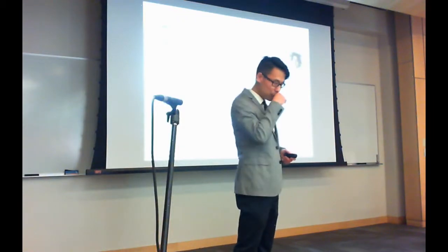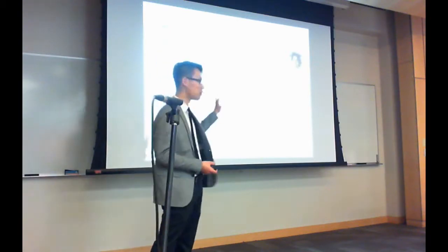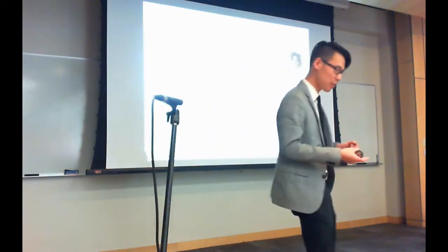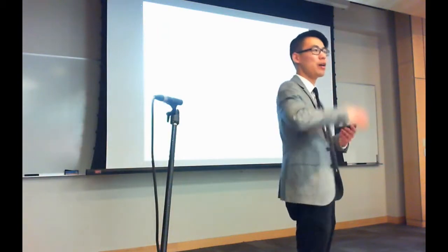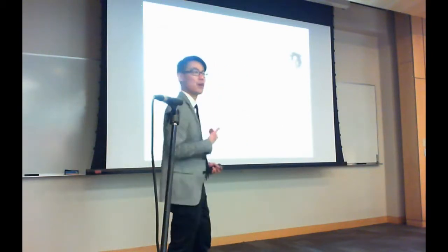If we want to assign significance, generally the null hypothesis in finding p-values for scores, you want to assume that your new query coming in is random. It's a random spectrum. And so you ask, what is the distribution of scores between my library spectrum and all random spectra out there? And that's modeled here in red, and that's the traditional way of doing it.